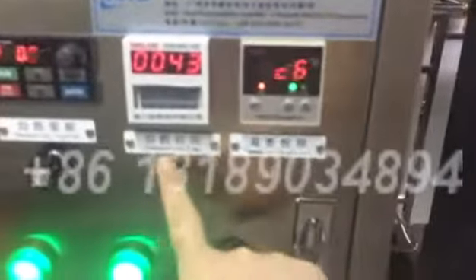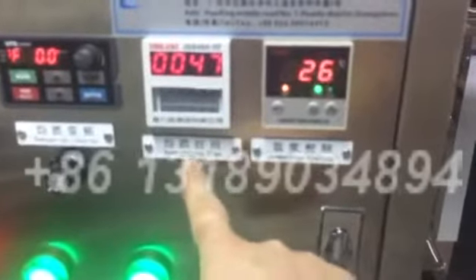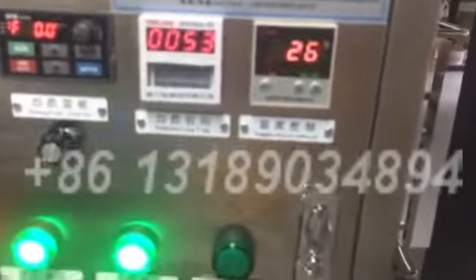Here is the homogenizer time setting. You can set the time for how long it will be homogenizing. It is better no more than 10 minutes per time.